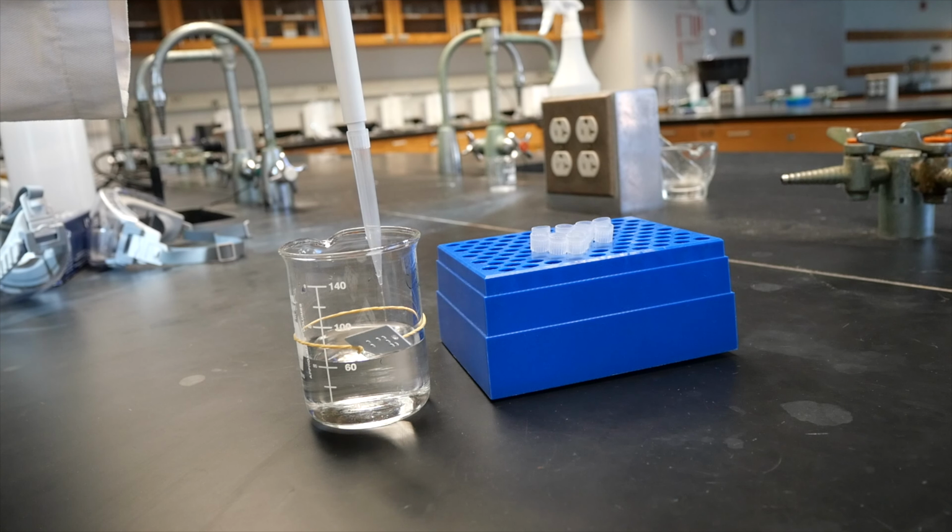There are also pipettes that have locks on the dial, so if you have multiple pipettes, you could set them to the ones that you need, lock them, and you don't have to worry about the dials moving around while you're using the pipettes. There's also electronic pipettes that can be controlled via other devices, and there are opportunities for this to work with screen readers, although I have not used any of these myself.